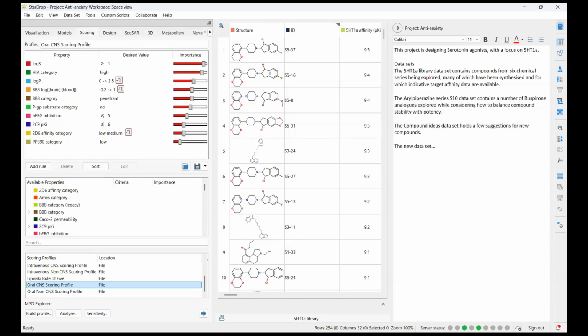The idea tracking capabilities I was demonstrating provide somewhat equivalent functionality to this, but of course what we have in StarDrop is purely for virtual compounds. For the time being, we're assuming that when using idea tracking, you'll want to hook it up to your compound registration system so that you can align identifiers automatically. Once integrated, anytime you add new compounds to StarDrop, it can go and check your registration system so that if an idea has already been registered, you can see the ID there as well as in the idea tracker ID. So from our perspective, our focus is on providing that seamless link between the two, but we don't have any immediate plans to develop our own right now.